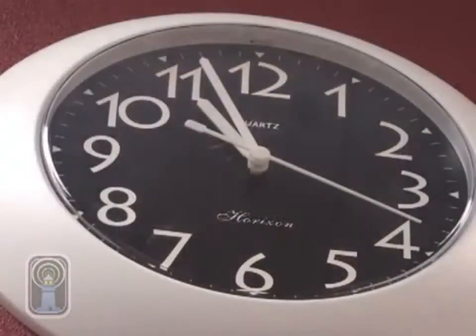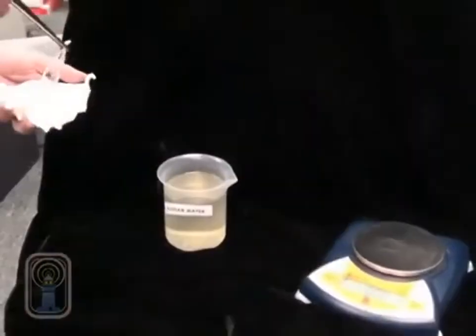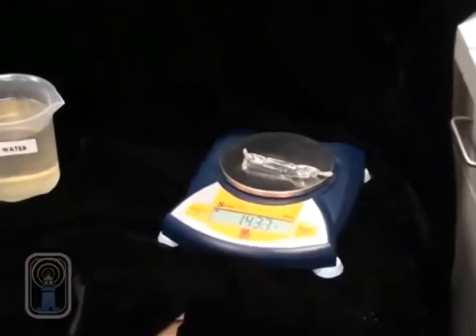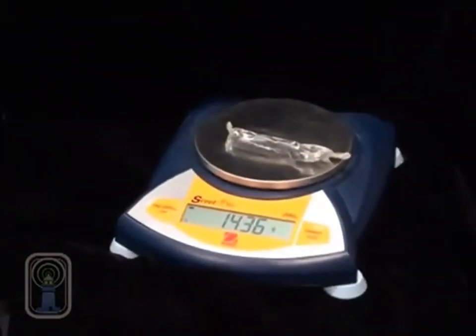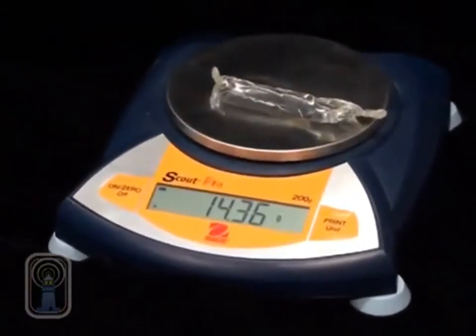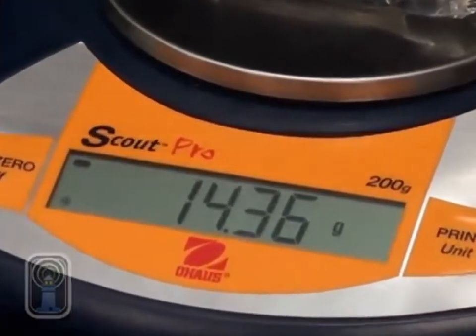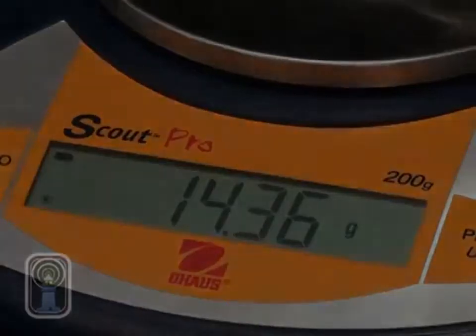After approximately 30 minutes, the cell was removed from the sugar water solution and again weighed on the digital balance. As you can see, the cell lost a significant amount of weight and has become very flaccid, or lacking in firmness. When a cell shrinks, it is said to be crenate.